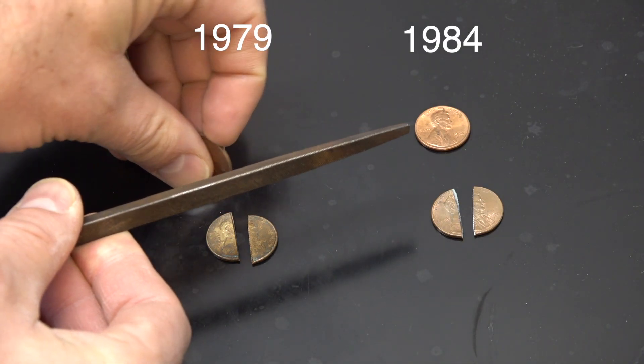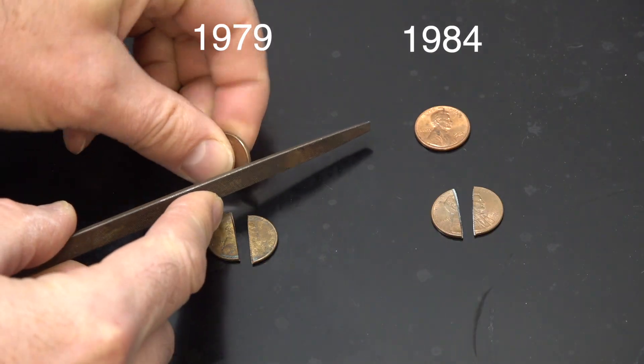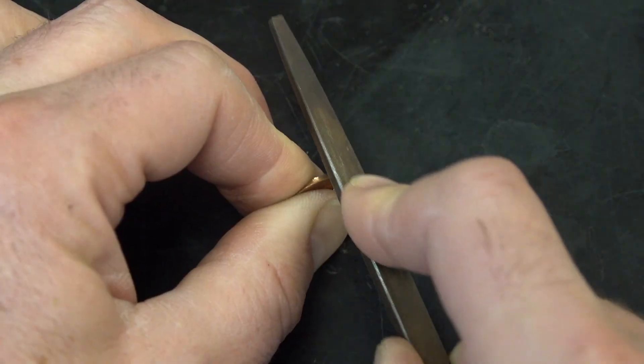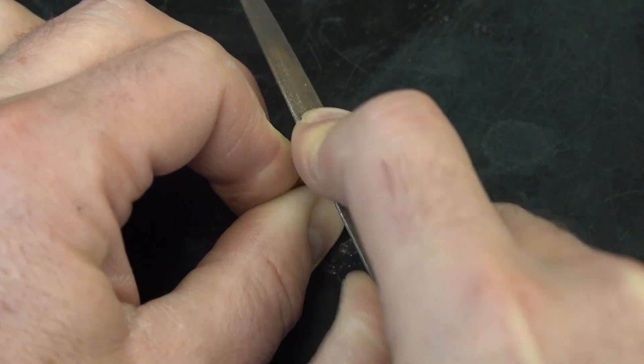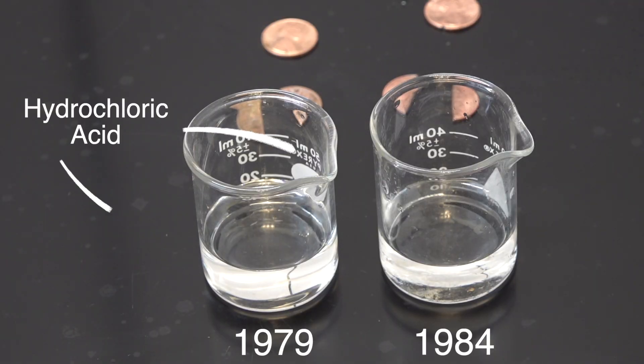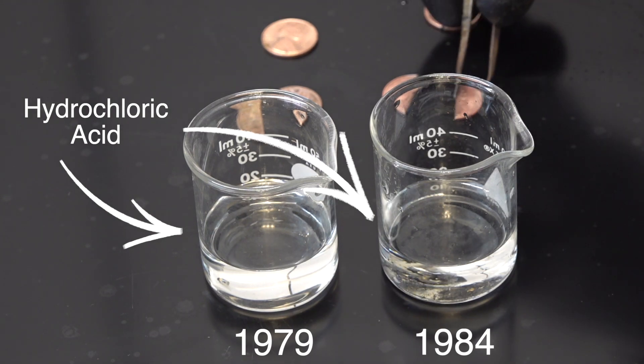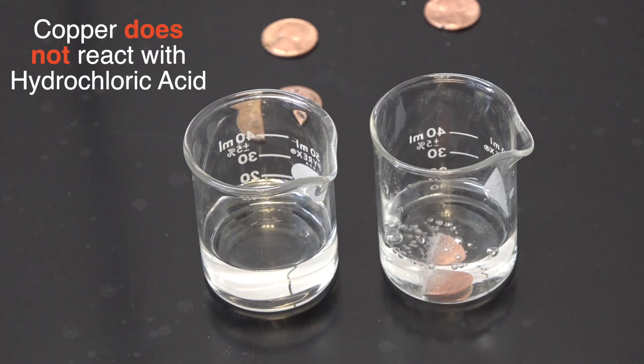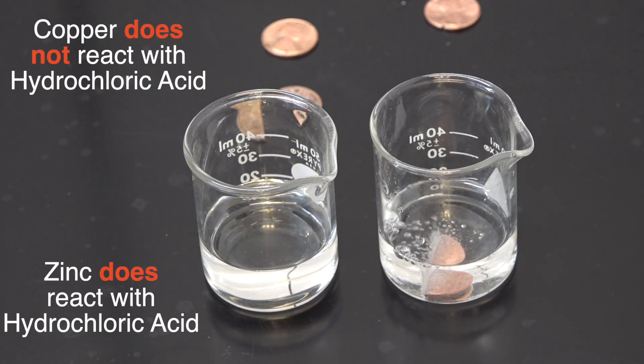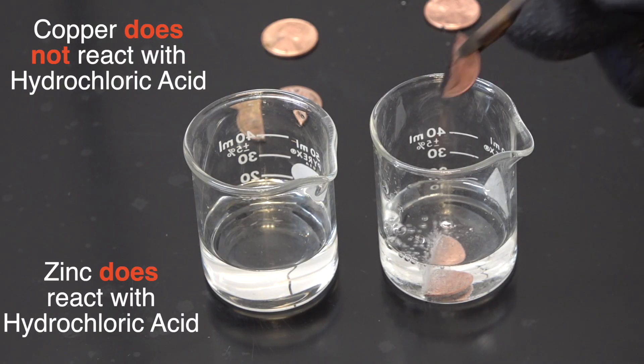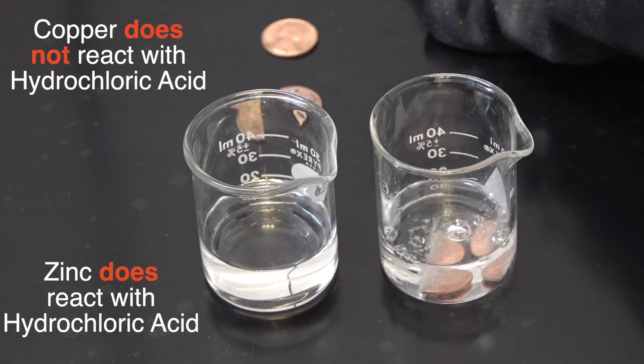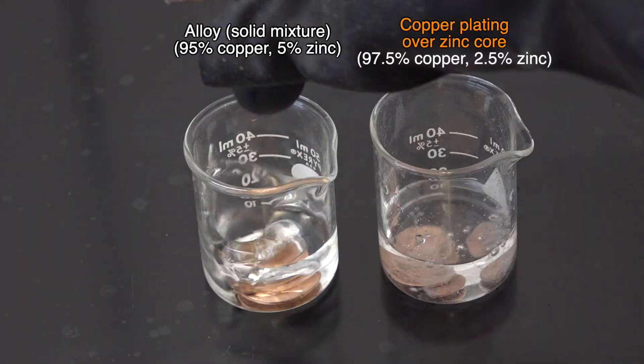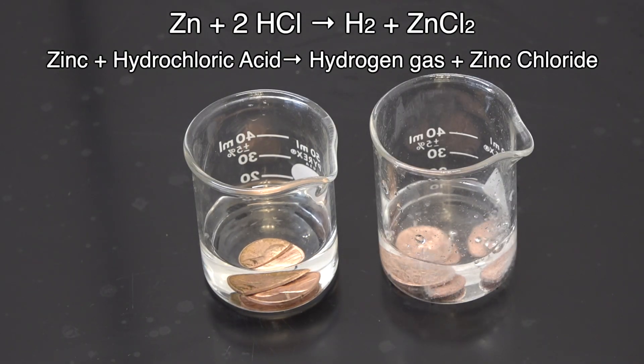We can use these differences to make hollow pennies with some simple chemistry. What we're going to do is take our old pre-1982 pennies and our post-1982, and I'm just going to take a triangular file and score it just enough that we're getting towards the center. Then concentrated hydrochloric acid and drop them inside. And then we're going to start to see the chemistry happen.